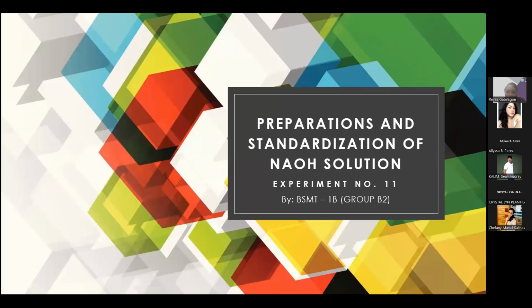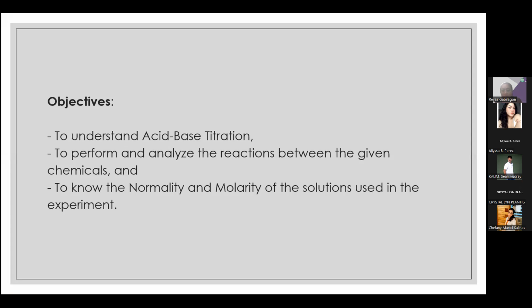We have sodium hydroxide solution here. Trabaho talaga yan, class, ng analytical chemist in the laboratory to prepare solutions with different concentrations. Kasi there are a lot of procedures that require, example, itong procedure na ito, nagre-require ng 1 normal sodium hydroxide. Meron ding other procedures that will require you like 2 normal na sodium hydroxide. So magkaiba-iba yun siya. And it's very important for us to know how to prepare them and how to determine the accurate concentration of this prepared solution.